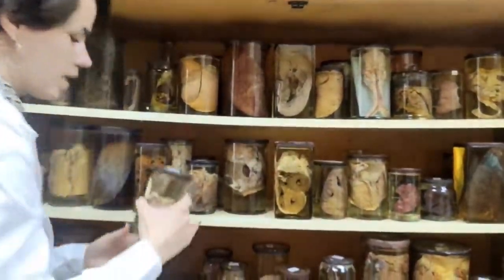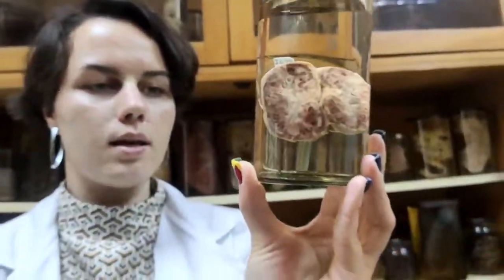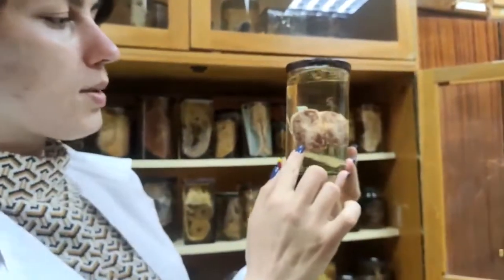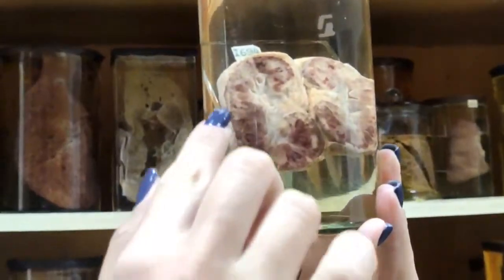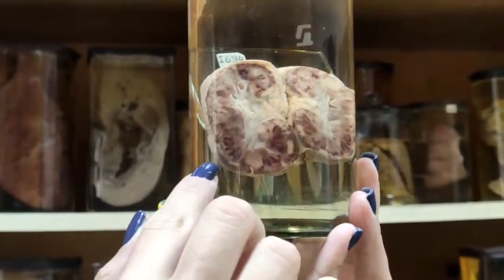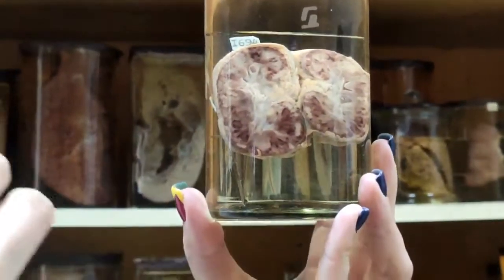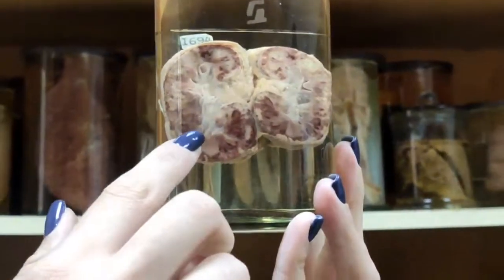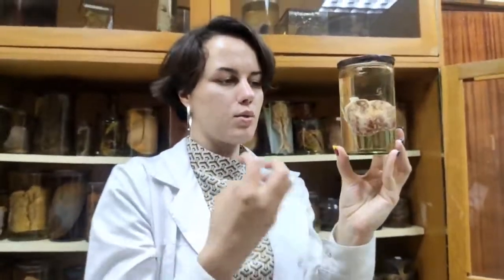The next one is acute kidney insufficiency. You can see that this kidney is probably a kidney of a child because it's quite small, and you can see a very good contrast between cortex and pyramids and medulla, because the cortex undergoes ischemia and we can see white color in the cortex, and the medulla is full of blood because here we can see necrosis of the tubules. Also, one component of shock is centralization of the blood, which means it will be concentrated in the central parts of the kidney.